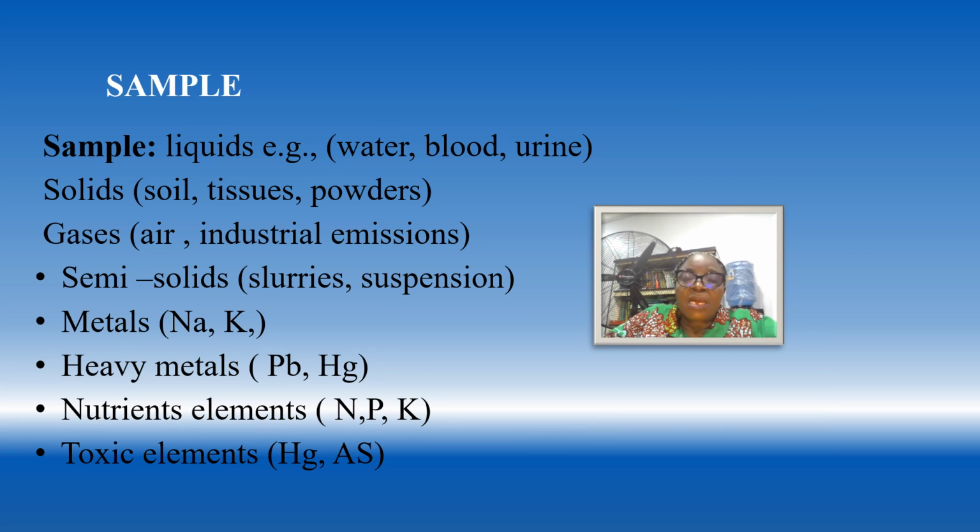In this atomic absorption spectrophotometer, we'll have where we put the sample. The sample is introduced into the atomizer. The atomizer is either a flame or a graphite furnace. And the sample is heated to a high temperature, breaking down molecules into atoms. The atoms are vaporized, creating a cloud of atoms that are exposed to light.